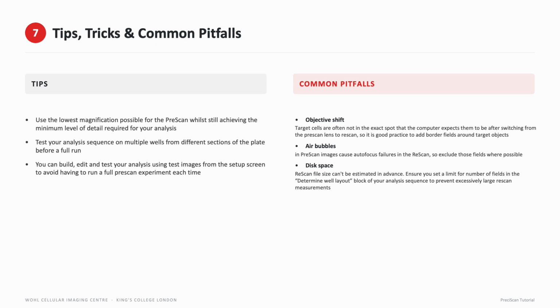Also test your analysis sequence on multiple wells from different sections of the plate. What you don't want to do is set up your analysis sequence for one well, then it turns out that well was a total outlier compared to the rest of your plate, and you now have an analysis sequence that doesn't work properly. You leave your experiment to run for 2 hours or whatever it takes, and then you come back and find that the analysis all went wonky, and your rescan is of a load of regions that are of no interest for you.